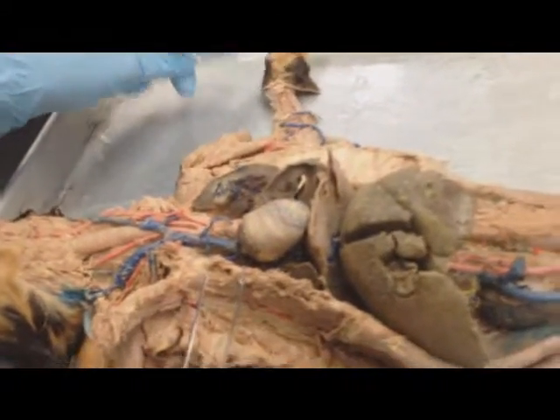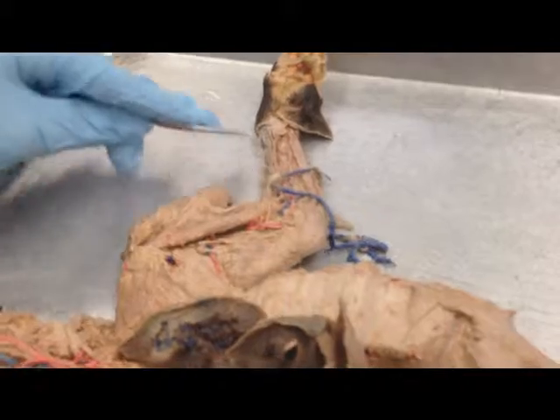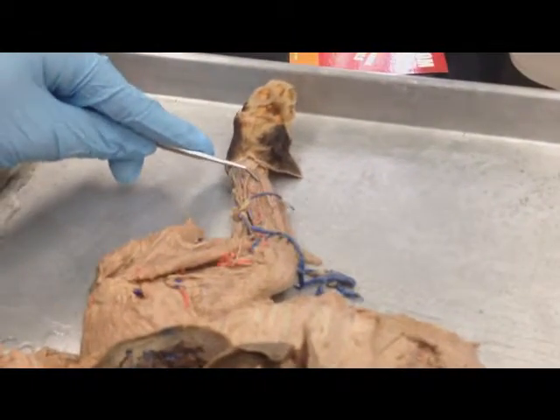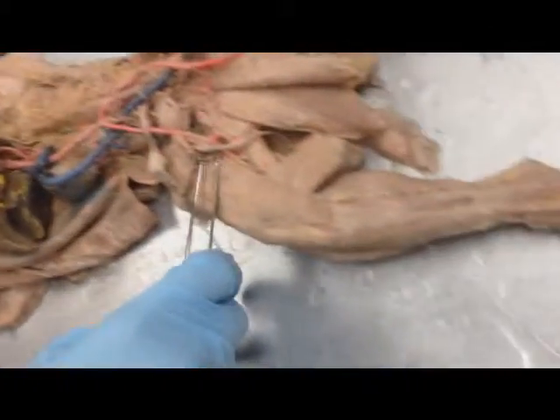I didn't mention, but the cat obviously has the radial veins and arteries, so that's 2. And the ulnar veins and arteries, that's 2 more. And then, oh, I want to go over this. I never did the leg, the saphenous, the arteries.